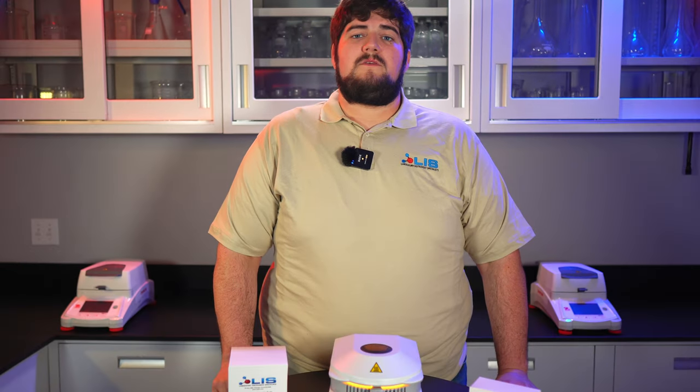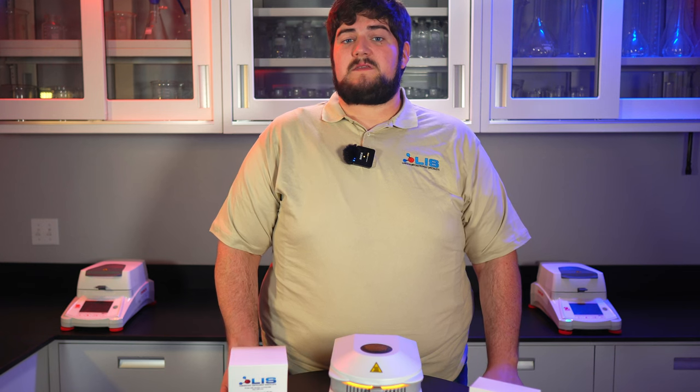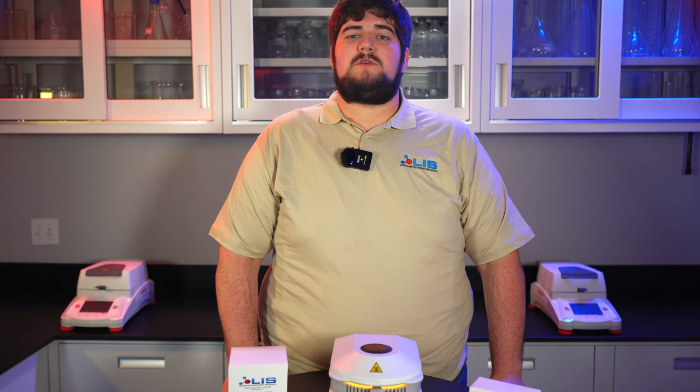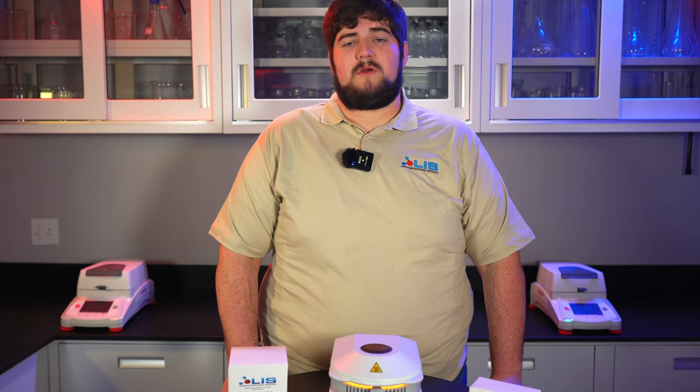Once complete, the 160 degree set point will begin. Follow the same procedure for this set point as well. If either the weight or temperature calibration is wrong on your device after performing this calibration process, please contact us and we will consult with you on the proper steps to ensure your device gets fixed and is calibrated properly.